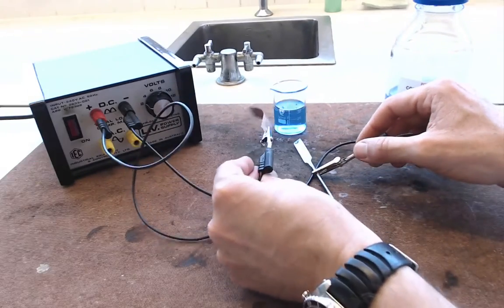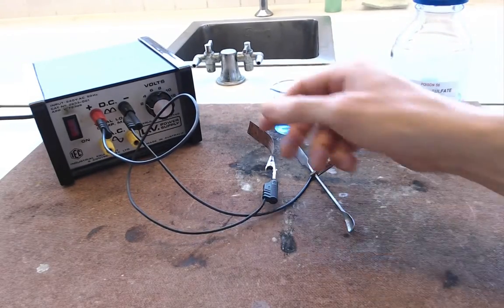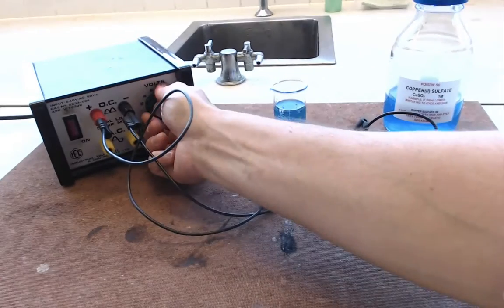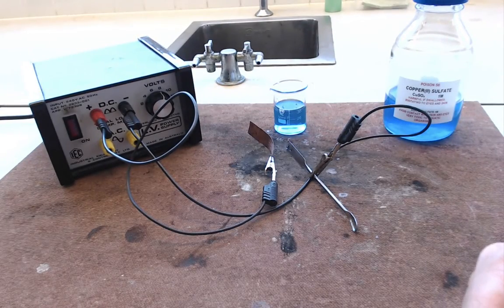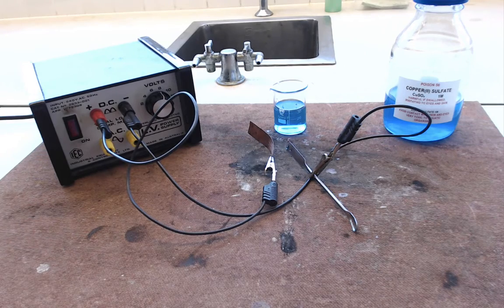This time you're going to try plating it on a different voltage. So we're going to turn our power pack up to 8 volts this time. And that will cause things to plate quite a lot more quickly.